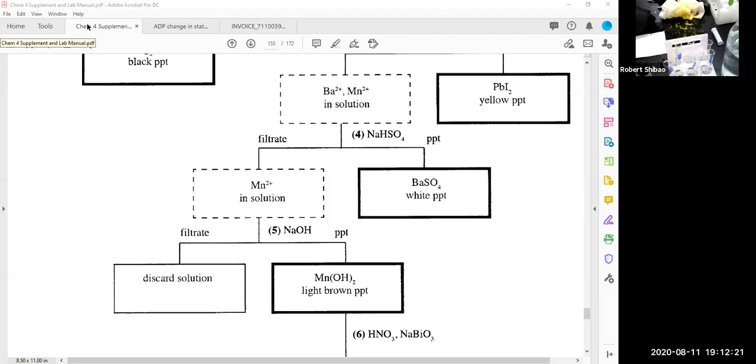I put some paper towel on here to absorb as much of the spill as I can. And so this precipitate is all PbI2 here. If it were Pb2+ (aq), it would be a lot more hazardous than PbI2, since the lead is locked in that PbI2 lattice. But still, you want to minimize contact. So fortunately, I have gloves on. Use the gloves.